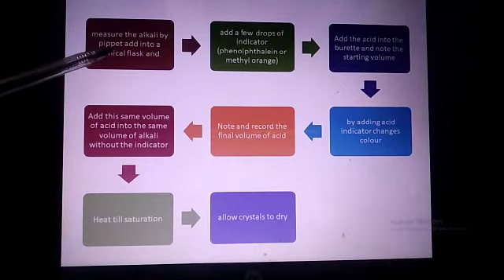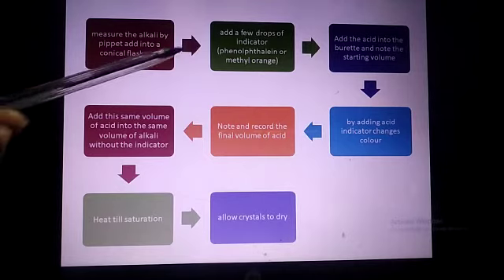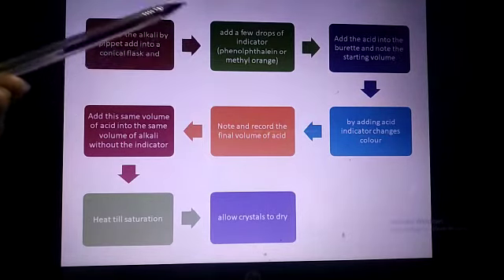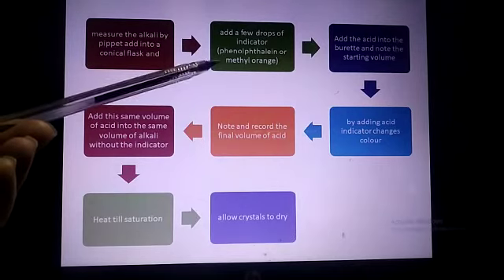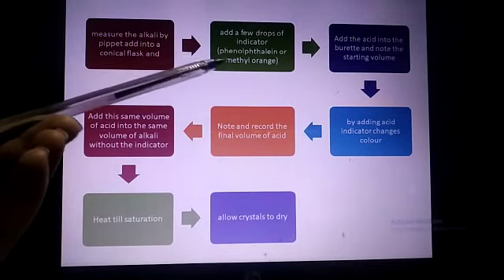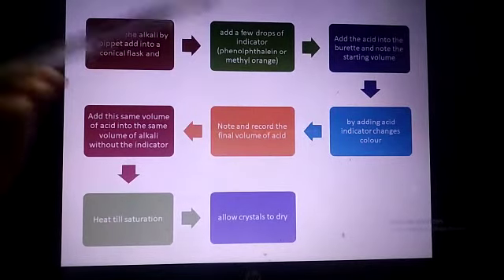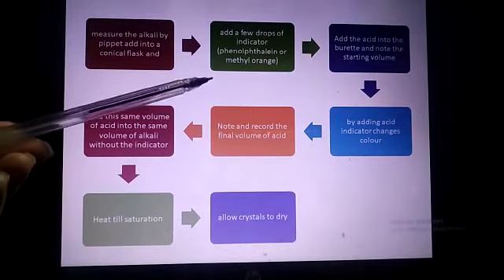Measure the alkali with the pipette and pour it into the conical flask. Then add the indicator - we can use phenolphthalein which gives out color, or the methyl orange indicator. The color change will tell the endpoint of the titration.